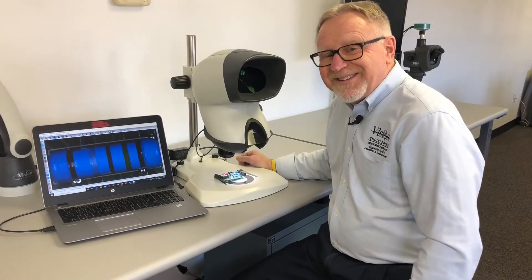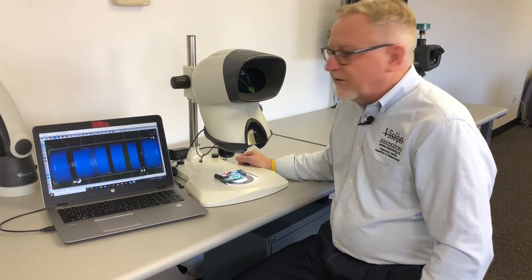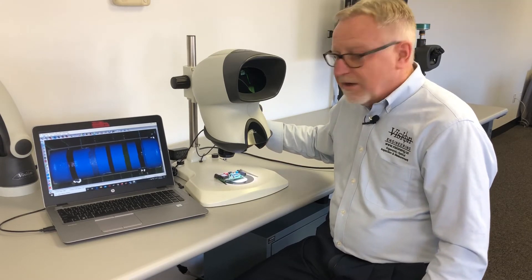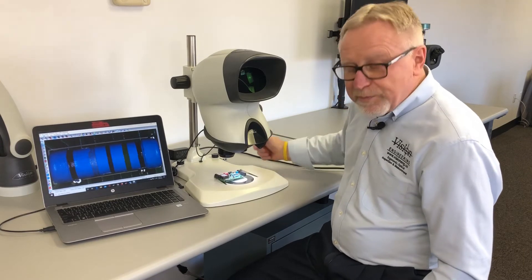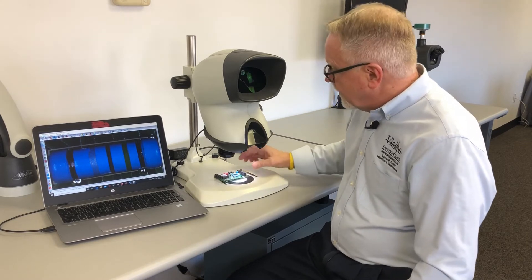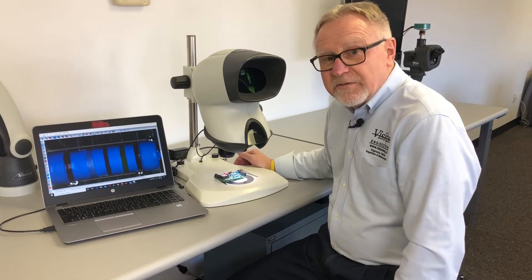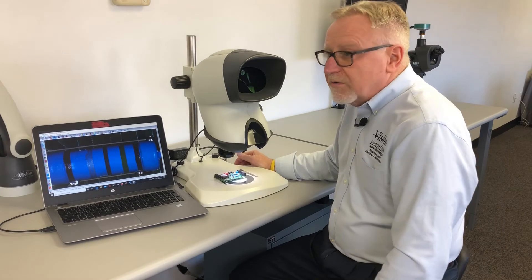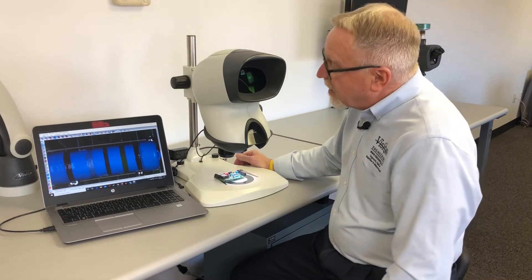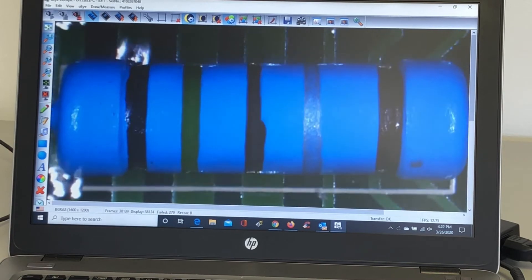This variant of our Mantis Elite is the Mantis Elite Cam HD. It incorporates a full HD camera into the Mantis. You can't tell that the camera is in there other than the fact that it has a USB connection on the back. USB runs to your PC — boot up the software and you now see what the operator sees in the scope on your computer screen. The image is live to the computer and the operator can't tell that it's even there. There's no beam splitter or levers that you have to throw, and it does not capture an optical path that shares it. The camera will let you capture still images and also moving images in an MPEG format.